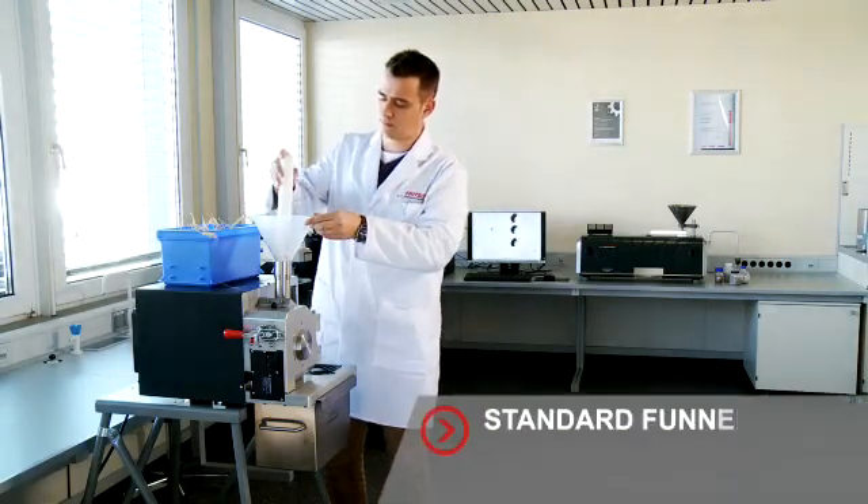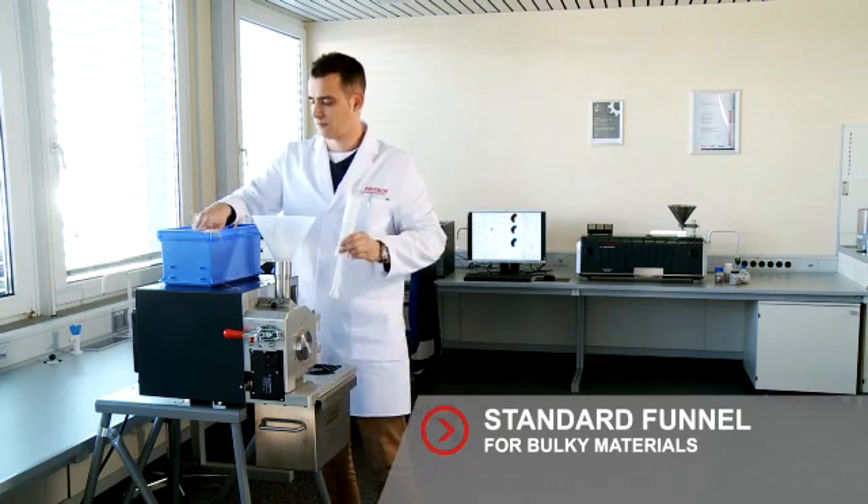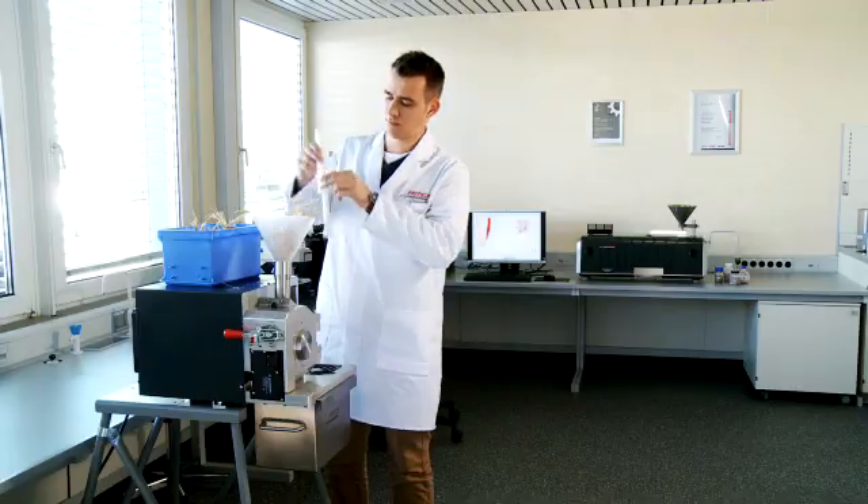With the Fritsch standard funnel, you can even insert bulky samples at full length, so there is no need to manually break up the materials first.